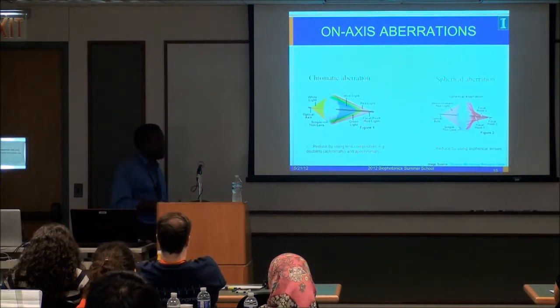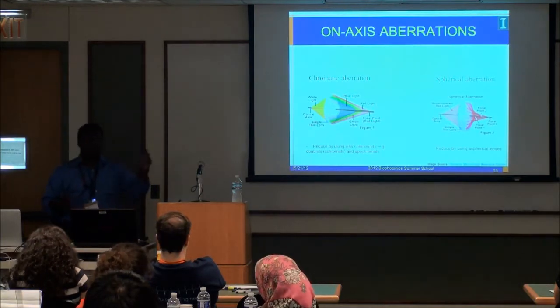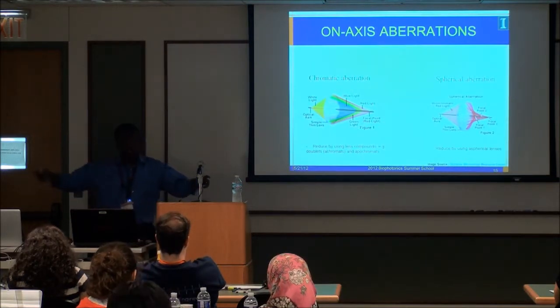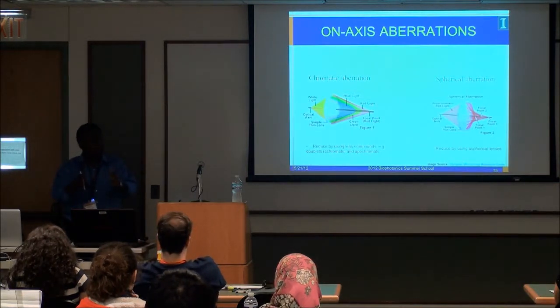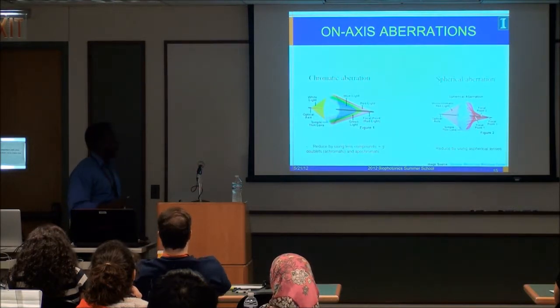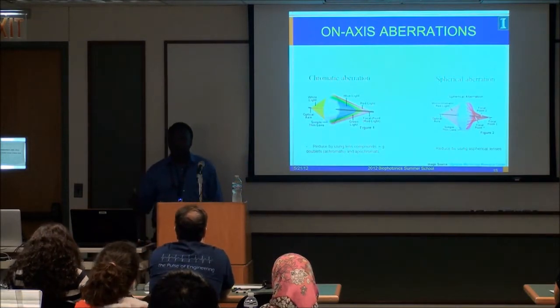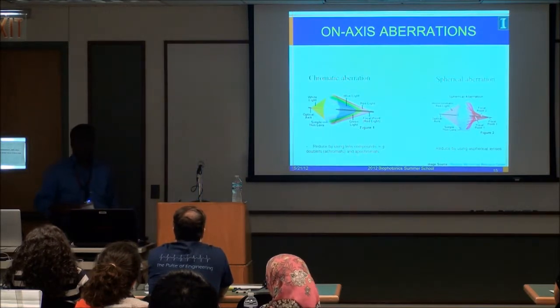this weird color effect. You can reduce this by using compound lenses. You use one lens of one type to focus the blue light to a certain area, and another lens of another type to focus the red, and you try to find a midway point. So you correct for two colors. That's called a doublet, also referred to as an achromat or an achromatic lens. Occasionally people want to correct for more, so three colors, and they insert fluoride as another material, and we have what's called an apochromat.